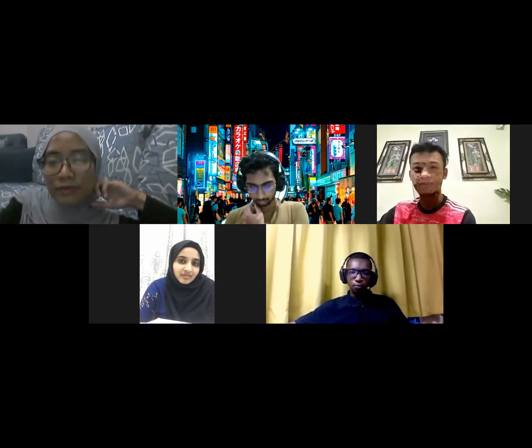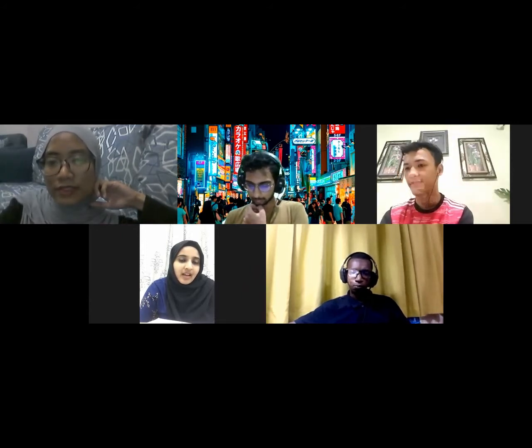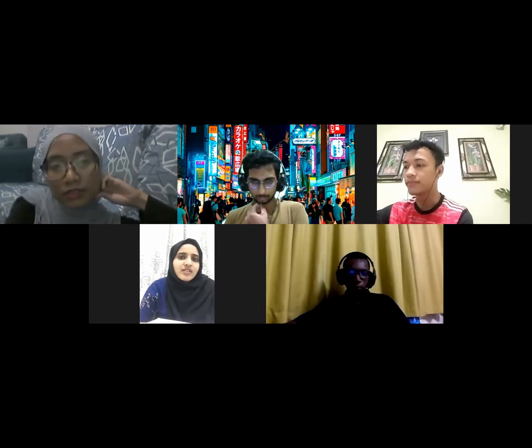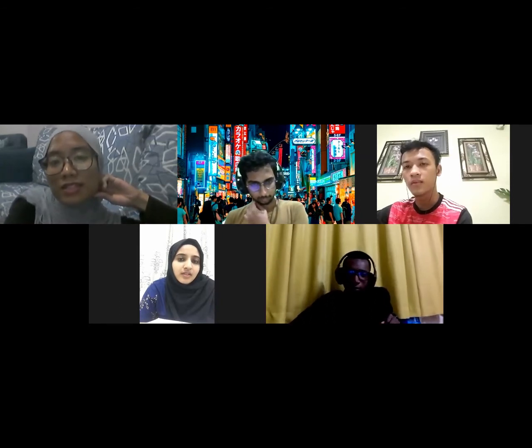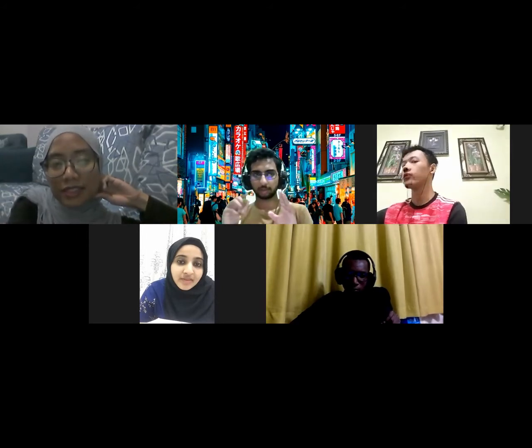For the TM, it is around 52 to 60, I think. The optimum one is 55. Actually, for TM, I found two different pieces of info. The first one is 52 to 58, and the next one is 57 to 63. But I guess that depends on our primer length and our GC content itself. The GC content and the length of the primer will actually determine the TM.